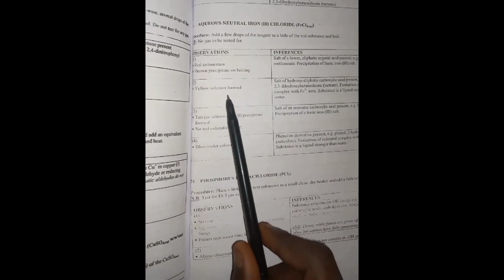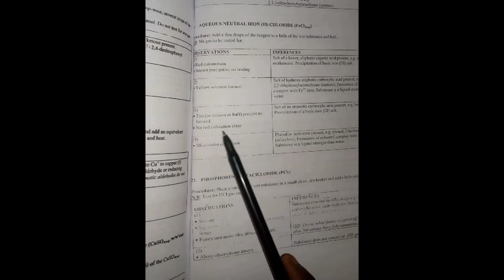Then if it was a yellow precipitate that was formed, or a yellow solution, no precipitate, you say yellow solution formed. That is going to be your observation only. Then now you say salt of hydroxyl aliphatic carboxylic acids present, e.g. you have that. You copy everything. Then the same thing.